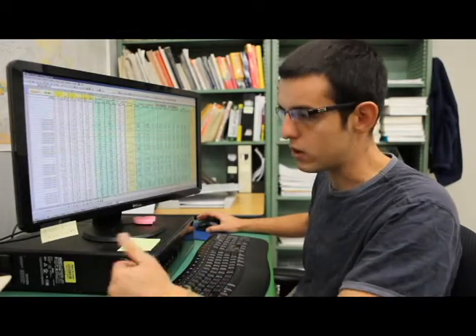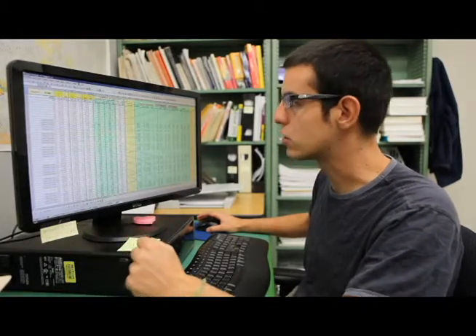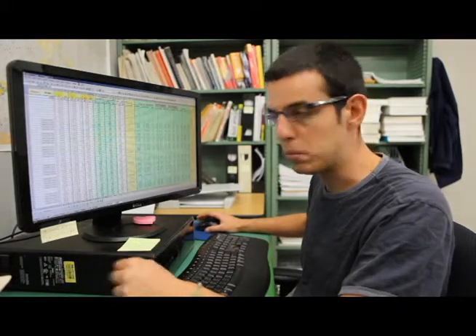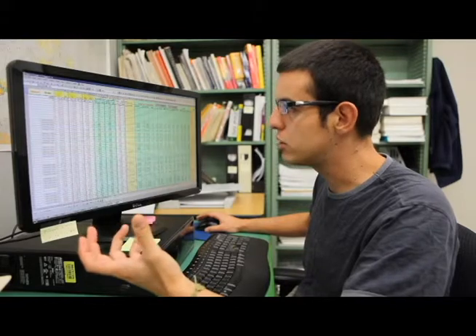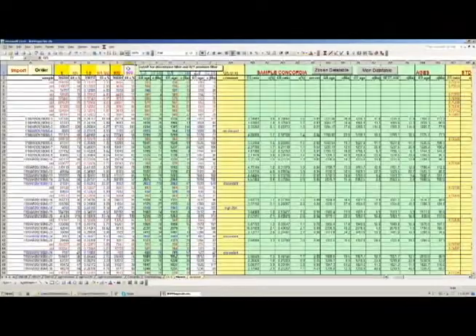Because we know now that as you go younger, those uncertainties in the measurements are larger. And also, the discordance filters are not going to be applied. So in general, we usually have this factor just being between 600 Ma and 400 Ma. And then depending on how your data looks and what analyses are being rejected on column AA, you can modify that.